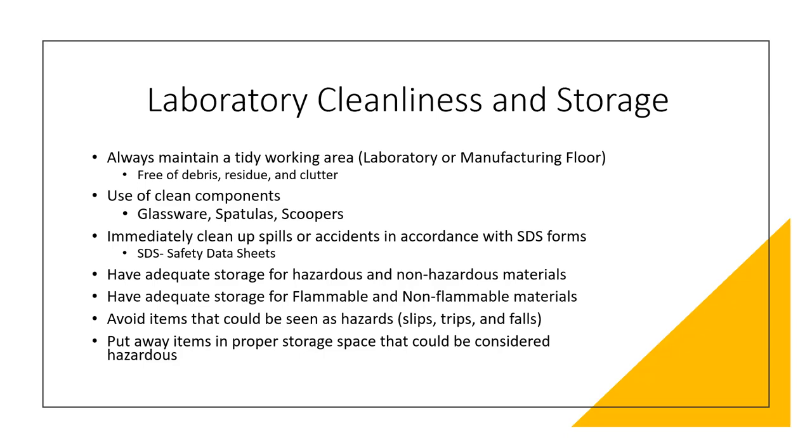So we also want to avoid items that could be seen as, like I said, trips, slips, and falls for maintaining a tidy work area. And we're going to put away items that could be considered hazardous in proper storage spaces. Safety hazards can be avoided by proper storage, obviously, of any materials that are not being readily used, clearing countertops of unused chemicals and equipment, and assuring all pathways in the laboratory are clear of any trip hazards. So we want to make sure that when we're not using specific reagents or specific chemicals, we put them away in their proper storage areas, because you don't know how a chemical or a reagent is going to react by being exposed to light or being exposed to the elements outside of a proper storage container.